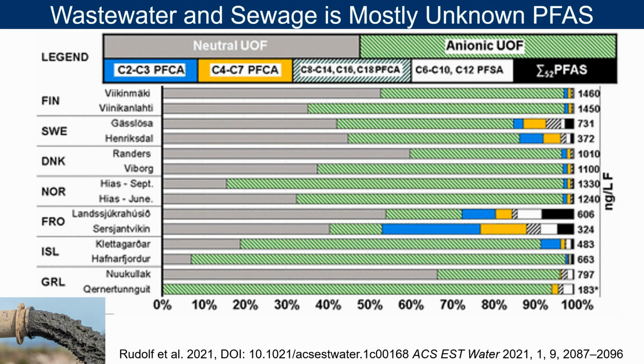Now, this is getting into a question of why non-targeted PFAS. And we haven't discussed what targeted and non-targeted is, but very briefly, and then we'll go into more detail: targeted is you know what you're looking for, specific PFAS, and non-targeted means you're looking for everything, including unknown PFAS.